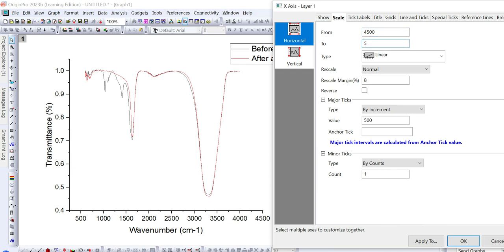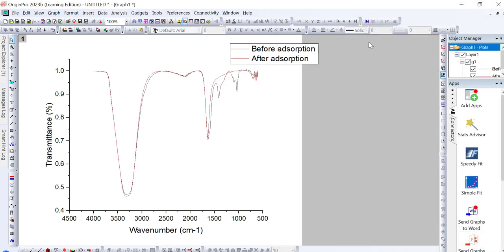Set the FTIR graph to start from 4500 and end at 500 per centimeter. In this way, the order of values will be reversed to the correct one — starting from the higher value and ending on the lower value.